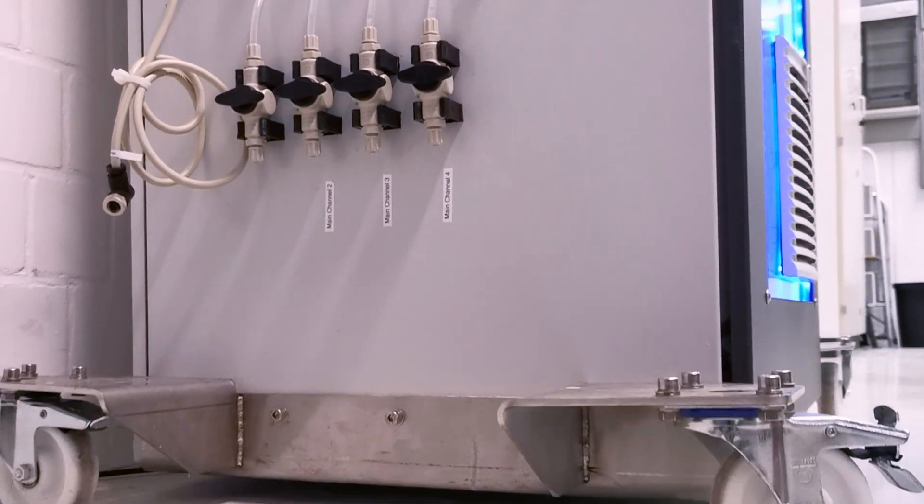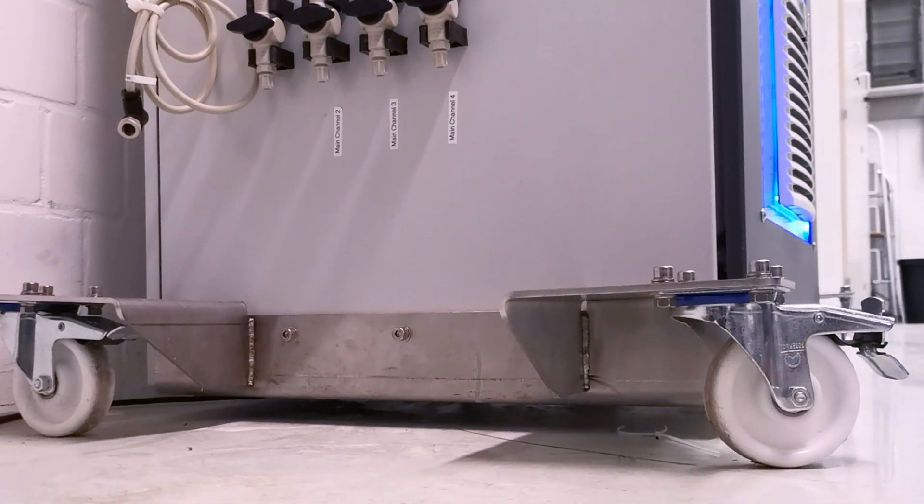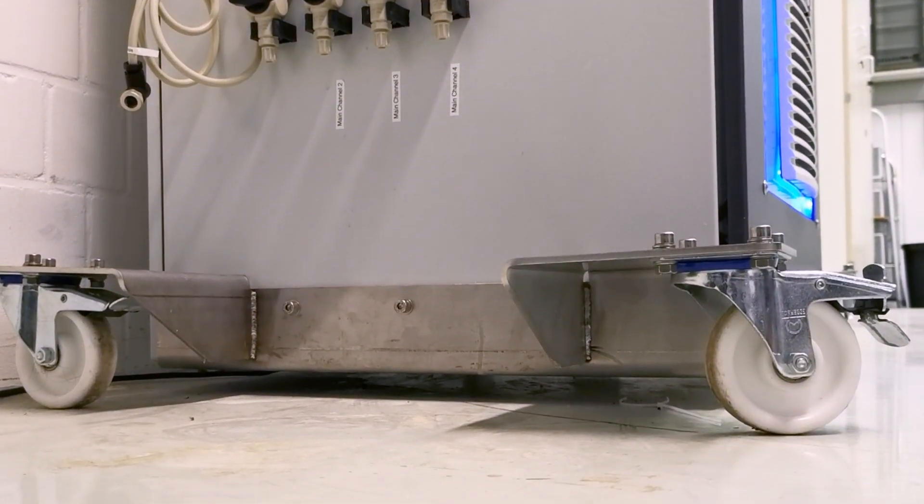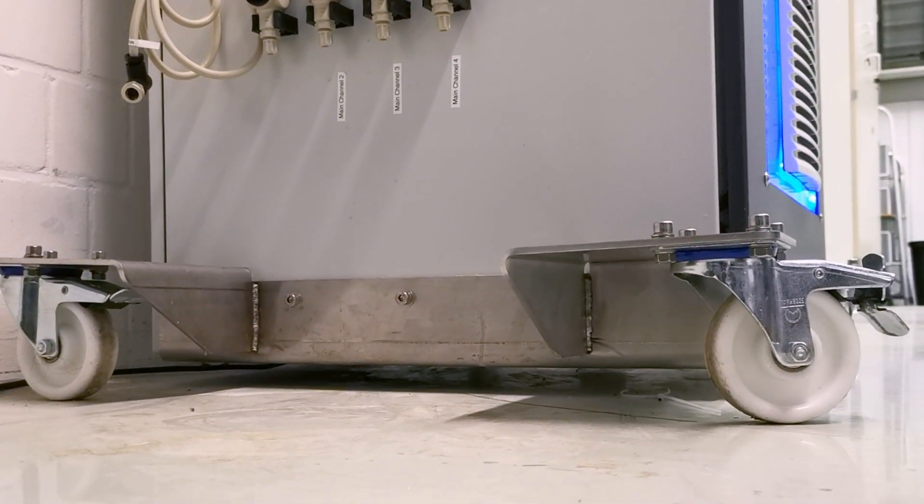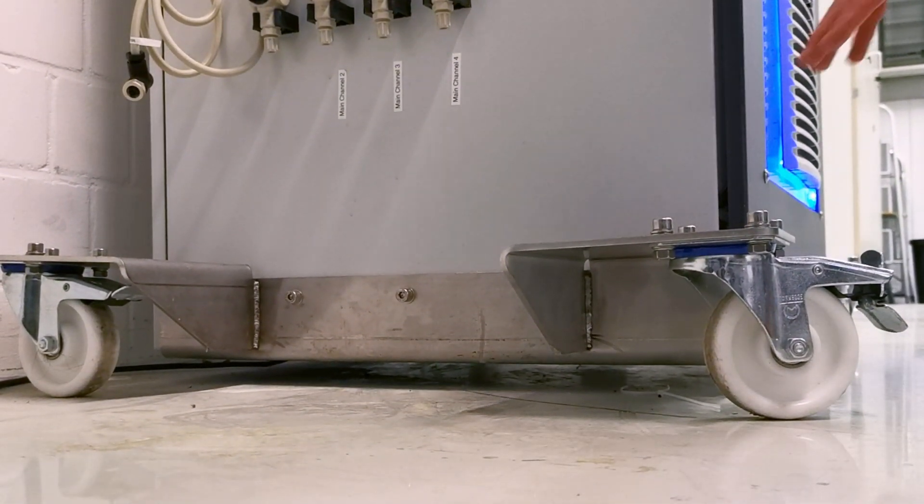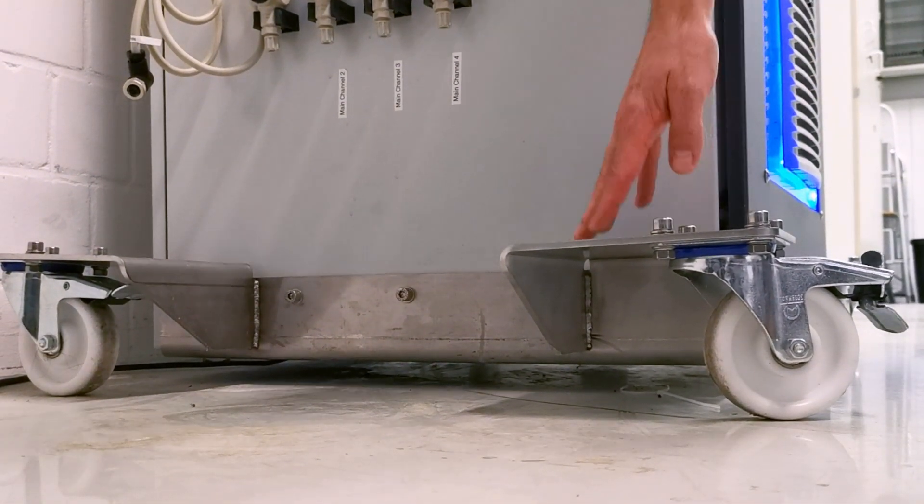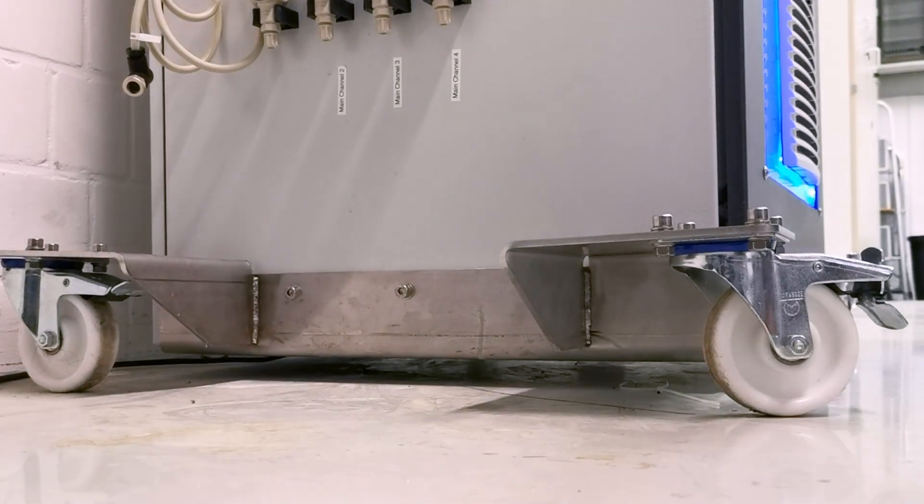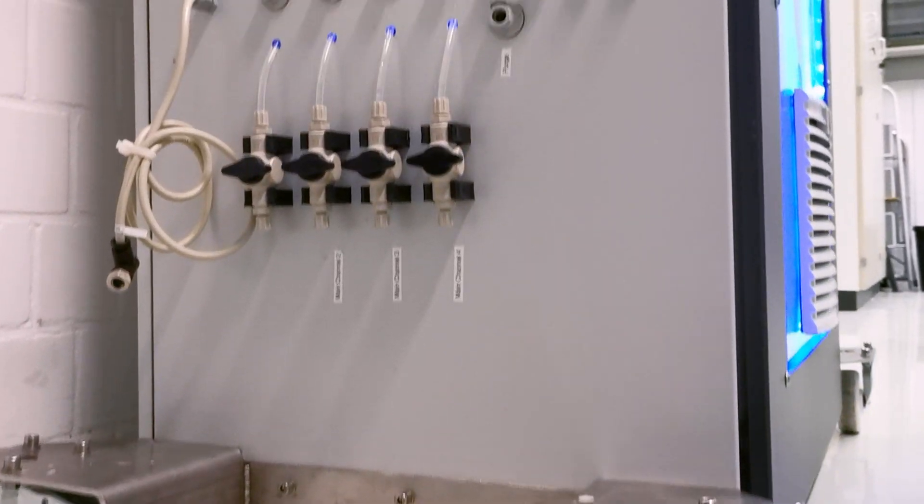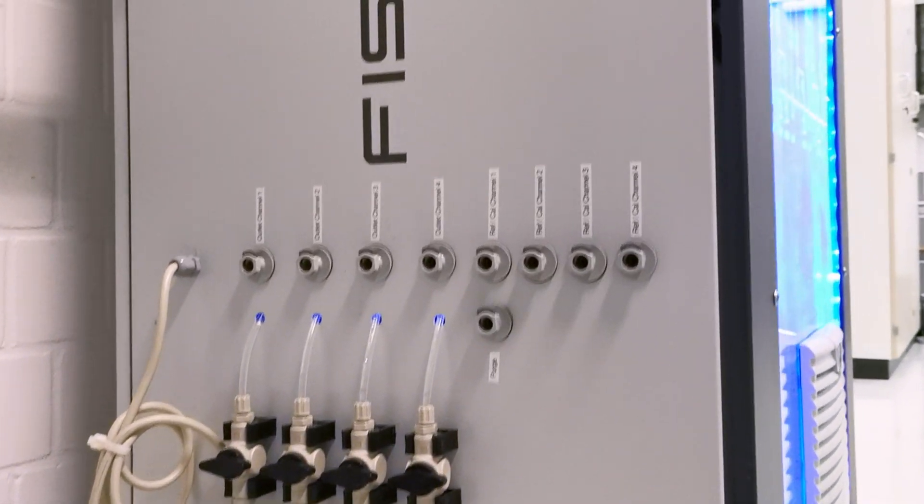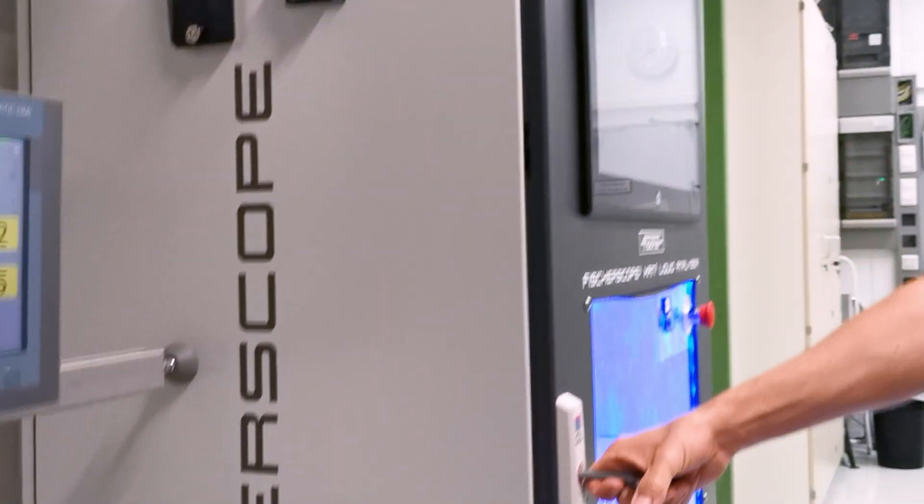And if you want to use the instrument in different locations, you can use the optional undercarriage and move the cabinet in a very easy way.